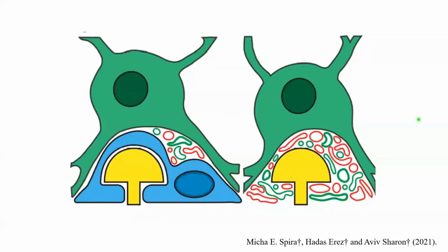Following the confocal imaging complemented by the transmission electron microscope images, this is a scheme that depicts the situation: microglia engulfing the electrode, mechanically preventing and electrically insulating the electrode from the neurons, and neurites and branches of astrocytes that extend into the space between the neuron cell body and the electrode and shunt the signals generated by the neuron from the electrode. In order to set a proper extracellular environment to enable the configuration of a neuron cell body to engulf the electrode, we have to eliminate those microglia that tightly engulf the electrode, remove astrocyte extensions, and also prevent neurite growth that interferes with this interface. And eventually, we also need a factor that will lure the neuron to engulf the electrode.